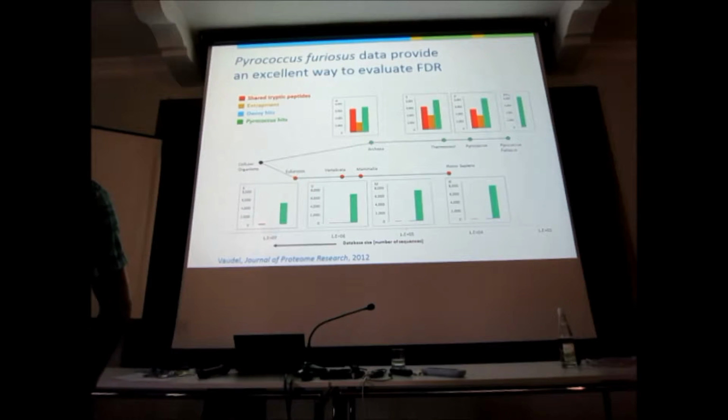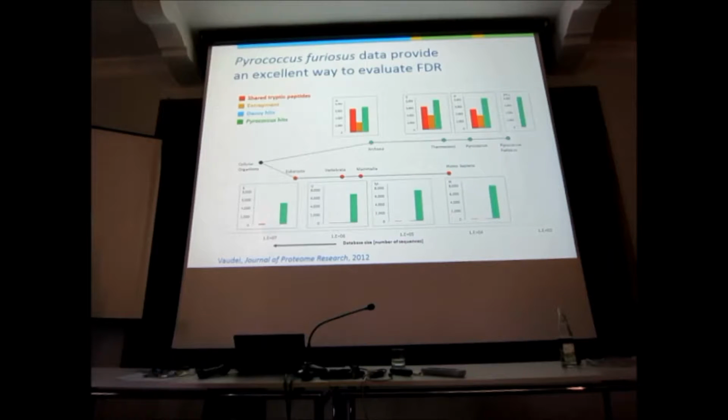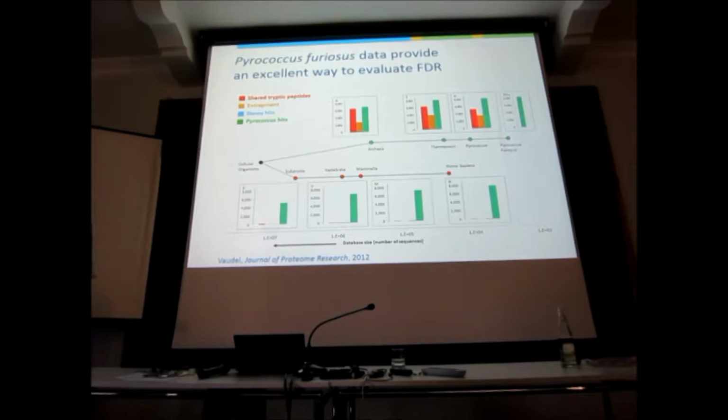Okay? Let's go through that again. Decoys mean if I get 10 decoys out of 100 total hits, the 10 decoys are a model for 10 wrong hits in the real search. So I've got 10 out of 100 that are wrong. So my FDR is 10%, 10 out of 100.